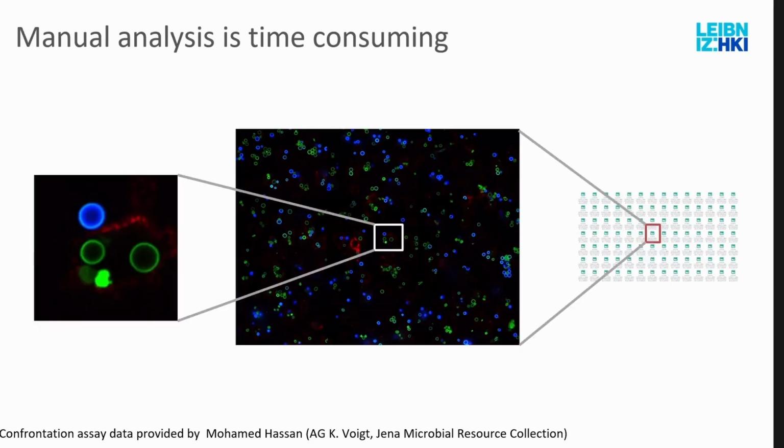And then we have the big issue, as in really big, because what I showed you is of course not one image. It's just a cutout of one whole image. It looks like that. This is a real screenshot from one of these visualizations produced from this data. But then you not only have one, you have a folder with hundreds of them.